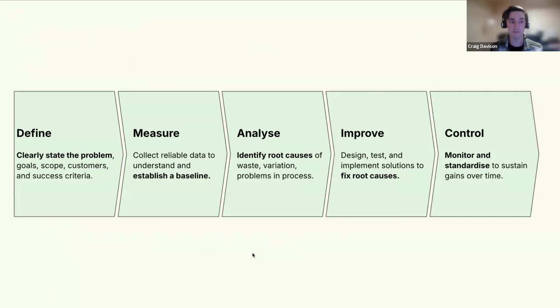So to recap, we've discussed the importance of utilization tracking and lab equipment scheduling as a whole. We've gone through a real world example with the HPLCs. Hopefully, you now have an intro into DMAIC and how it can be applied to lab equipment utilization. I really do hope this has provided some practical tips to tackle specific challenges in your specific labs and ways that you can define the problem, measure what's really happening, analyze root causes, improve it with targeted fixes, and ultimately then control it so the improvements stick.